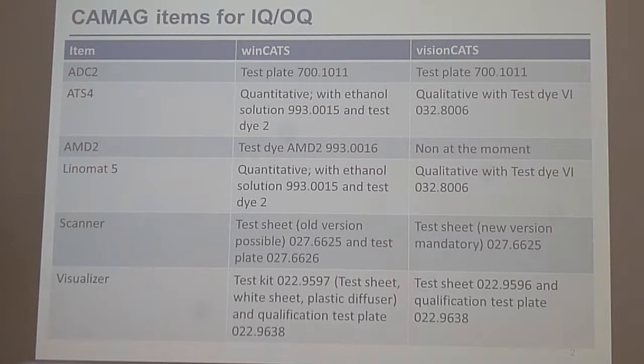But with the new VisionCats, with 2.4, I assume there will be the possibility to scan on the same point again 28 times.